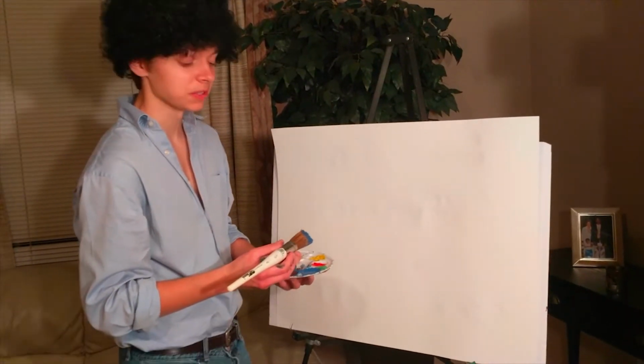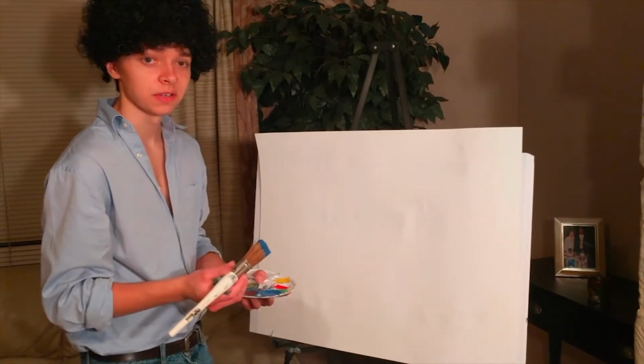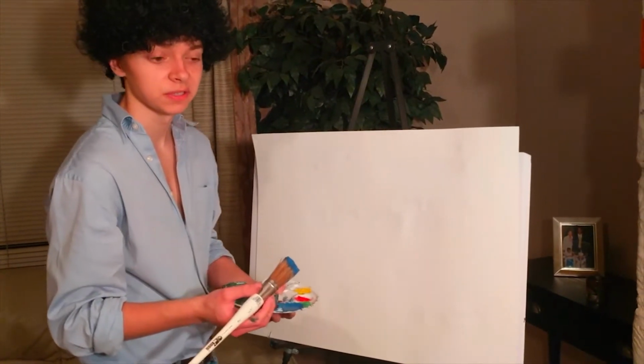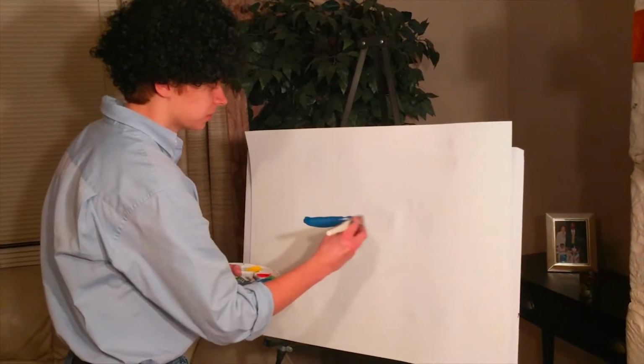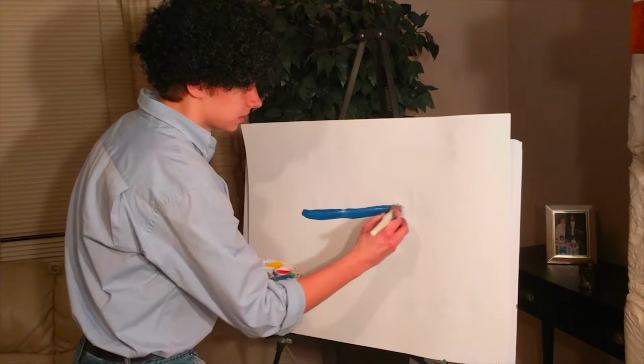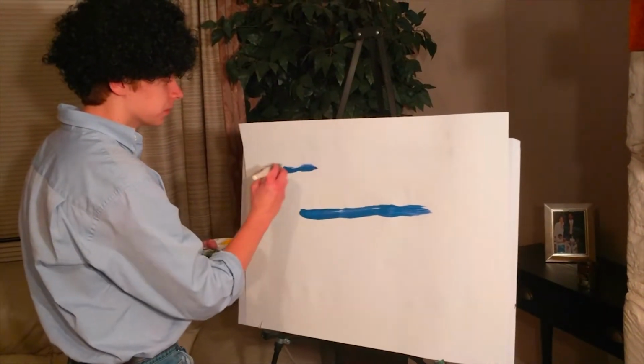Today on the show we're going to be talking about Sanger sequencing. Now Sanger sequencing is what you do when you're trying to find out the sequence of a DNA. Now let's just paint ourselves a little DNA strand right now. And in Sanger sequencing you're going to have 4 tubes.